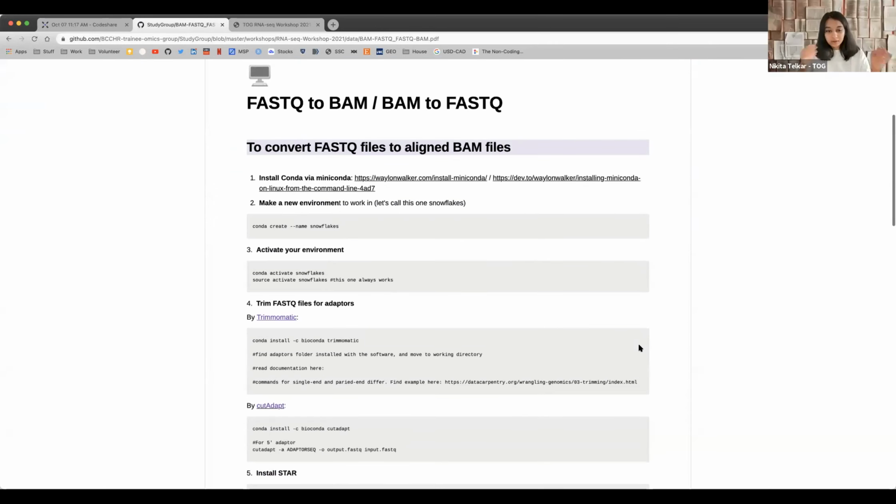Okay. So once you get your FASTQ file, usually from any sequencing center you get the raw FASTQ, but they also have the option to give you a BAM file, which is already aligned. However, because it's done by the sequencing center, they might have used some parameters that you might not necessarily want to use. So when I get my files, they're aligned using Bowtie. So that's the BAM file that I get.